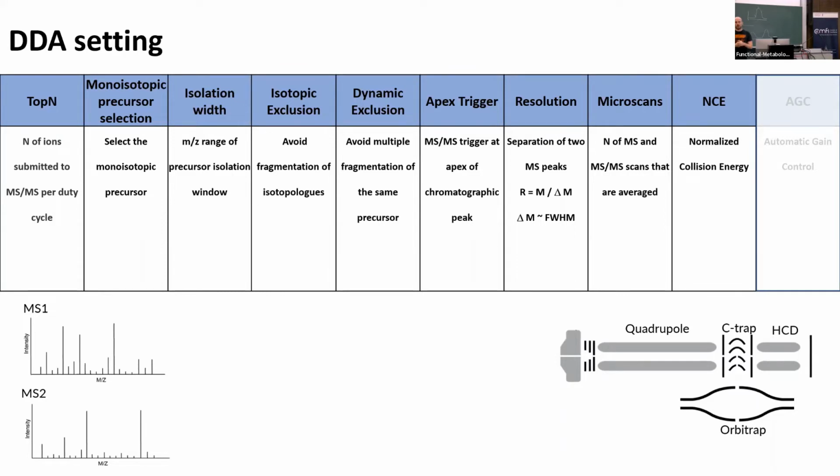Often libraries are also acquired by default at different collision energies. I think NIST, for example, has a lot of different ones. Yeah, I fully agree. One drawback on the step is that all the data is merged into one spectrum. It would have been good to have 3 files.